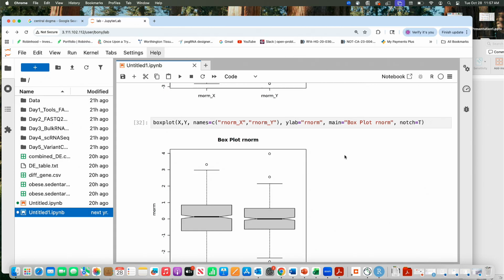Okay. That visual is even coming without a notch. Not with many data, actually some data. And the other thing is if you are using a notch, those who are aware of box plots will see that difference. Even the big differences showing with a notch will help.